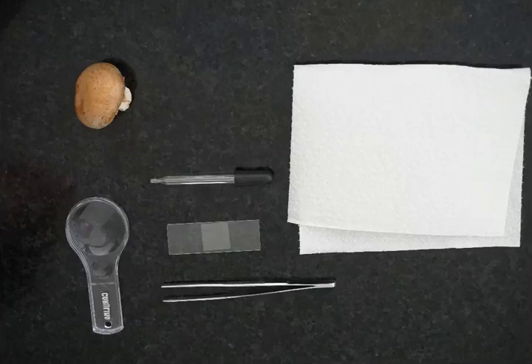Welcome to our first dissection lab of the semester. Today we'll actually just be dissecting a mushroom, but you might want to use some of your dissection tools.